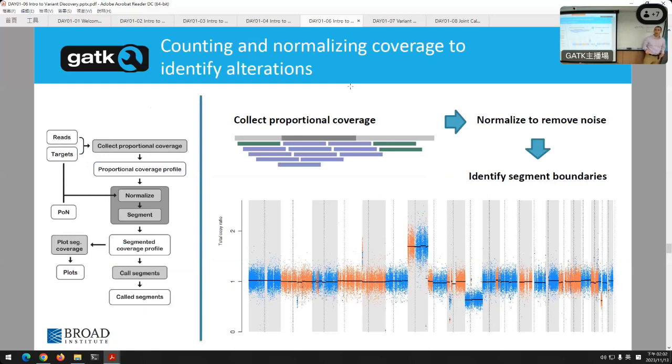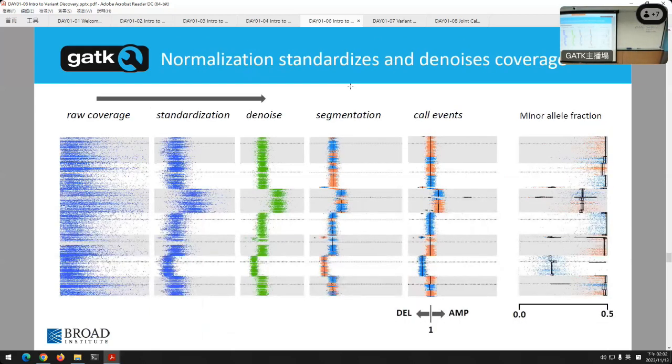So the Broad adds some extra for some exons that they like. They add some extra capture inside. So arbitrarily, the Broad is capturing differently than you do here in Taiwan. Okay, so all of that is very difficult, and we deal with that computationally. Okay, and we'll teach you all about this on Wednesday. All the processes and math and stats involved.